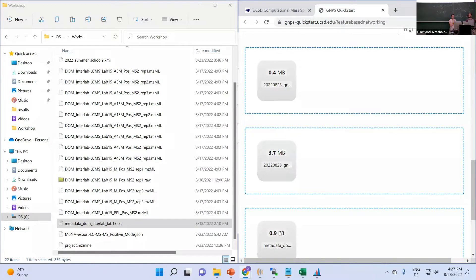Metadata is used later on so that we group files together, enabling statistical analysis and visualization on the networks that we produce with GNPS.